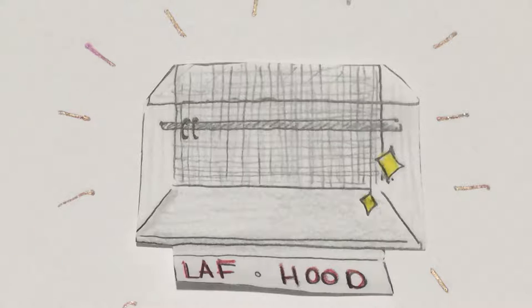To reduce the risk of cross-contamination within medication, a clean workspace is needed. For this video, I will demonstrate how to clean the laminar airflow hood where IVs are prepared.